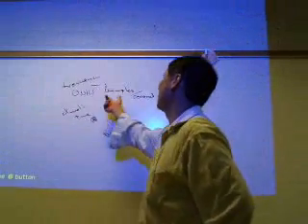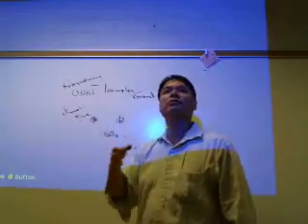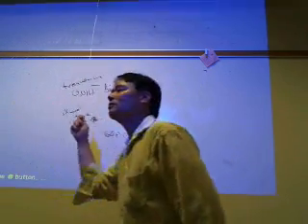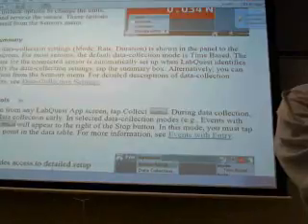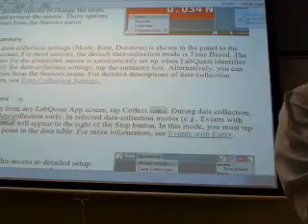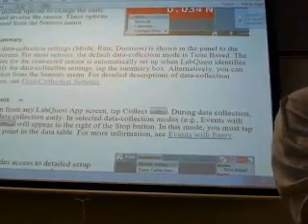And so what's easier for us? Is it easier to set the samples per second? Sometimes it is. Or is it easier for us to set the dwell time or the interval between data? The interval for us, because we aren't collecting much data. It's unusual. Sometimes it's a lot easier just to set the sampling frequency. Let's take a look at this. Why don't you go and hit the interval and change the interval to 60 seconds per sample. And then what does the sampling frequency tell you?